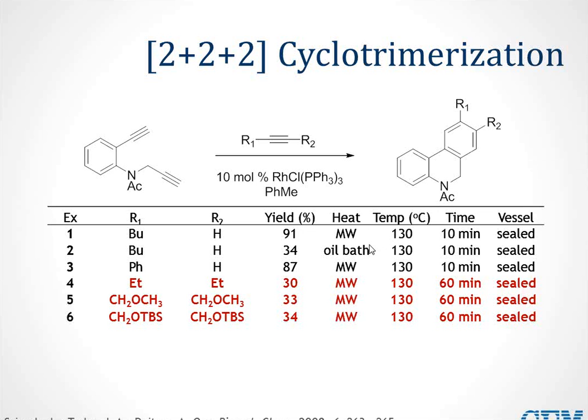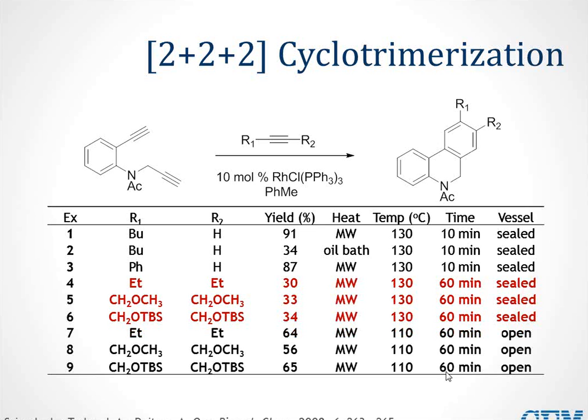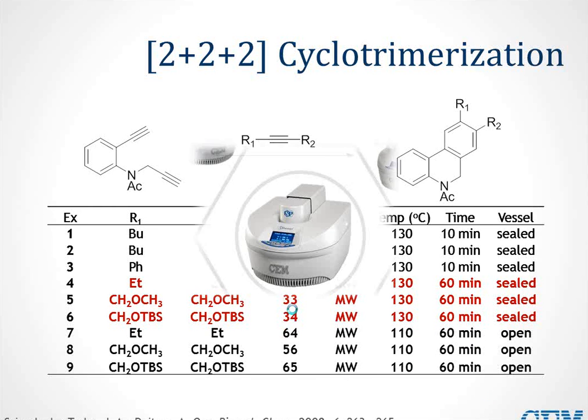So what they decided was, okay, well, running this reaction in toluene, why not drop it down to running at reflux, so now drop it down to 110 degrees, run it open, and then do syringe pump or slow addition of the alkyne to keep the concentration down in the reaction mixture. And so that's what they did, and you can see here they were able to essentially almost double in some cases the yield of the reaction running this in open vessels. So you can see there's definitely an advantage there.